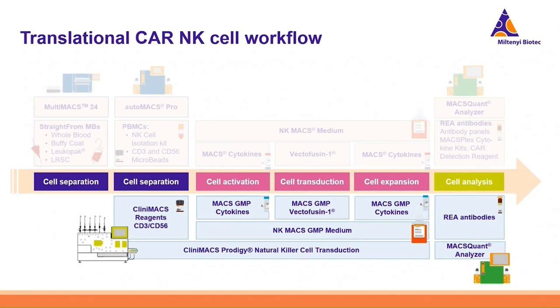For example, the use of feeder cells could be difficult in the future. Or right now, you're using the NK cell isolation kit instead of the reagents needed to separate in clinical grade, like CD3 and CD56 MicroBeads. So just keep that in mind.